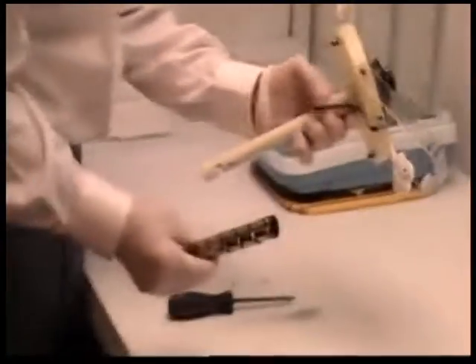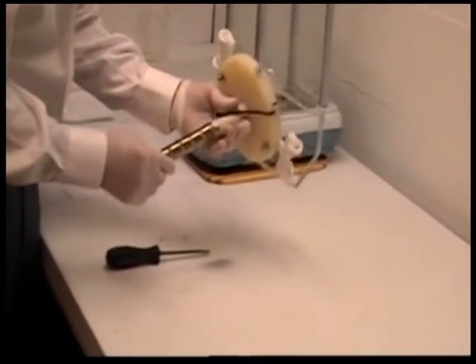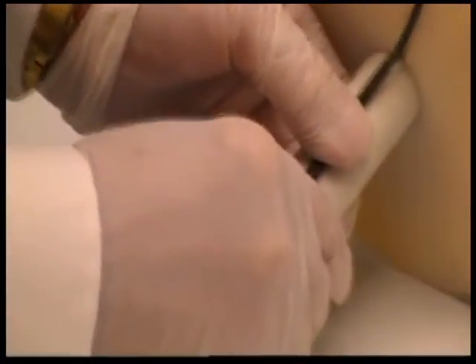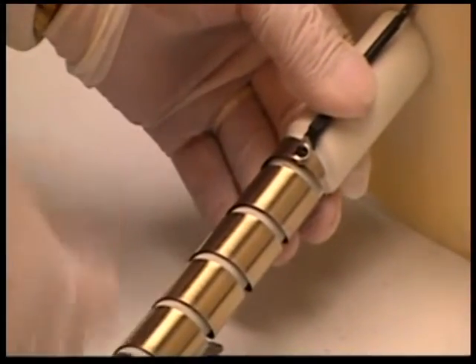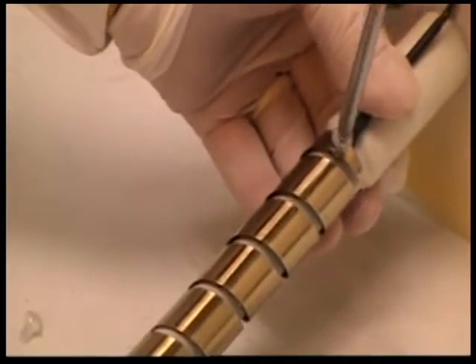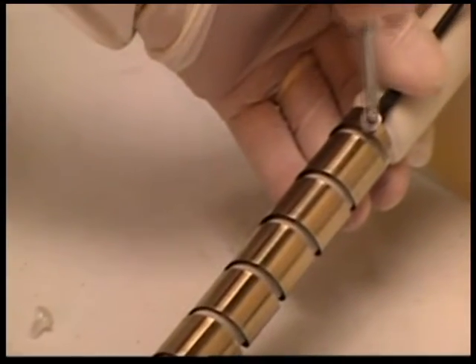Getting a close-up of mounting the helix under the spiral contractometer.